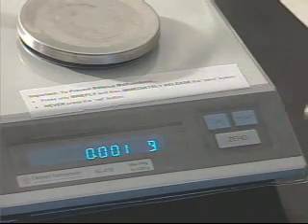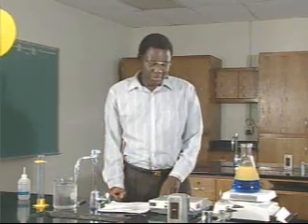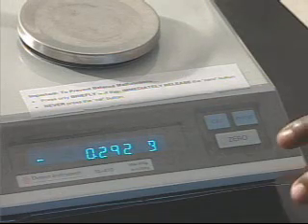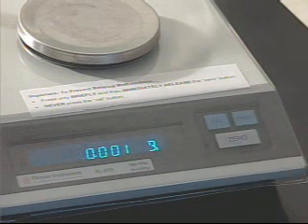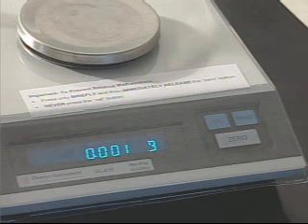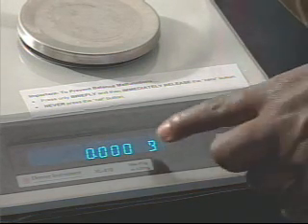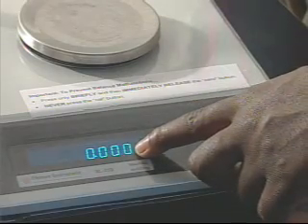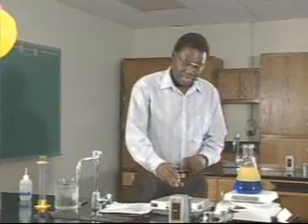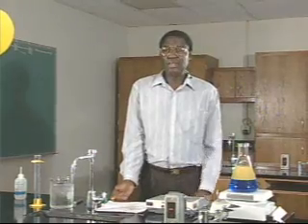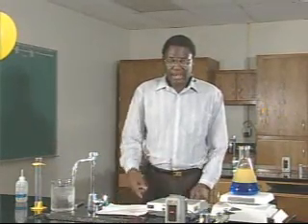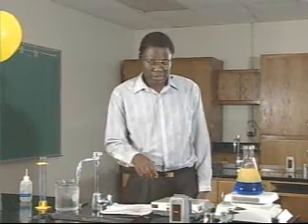This is the kind of balance you are going to use. You will see there is a button labeled zero — just press that once. Don't press it for too long because you will throw off the calibration, and don't press any other button. It should settle to zero. There may be a bit of fluctuation in the last decimal place, but that's okay. Take your object, place it on the balance, give it time to settle, and take your reading — that will be your mass.